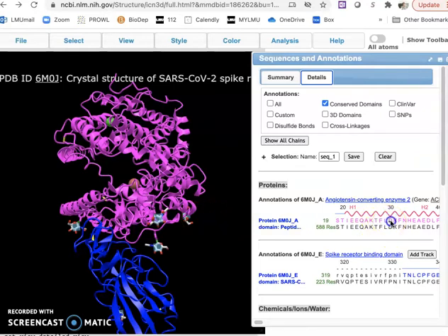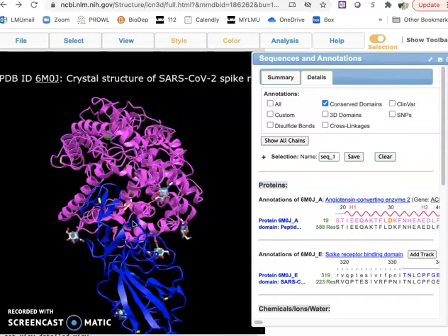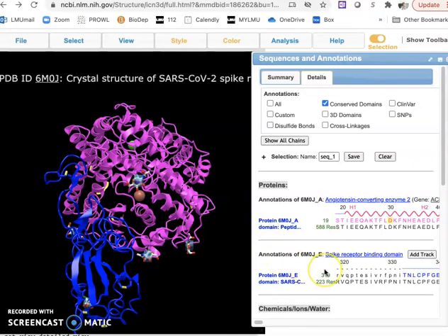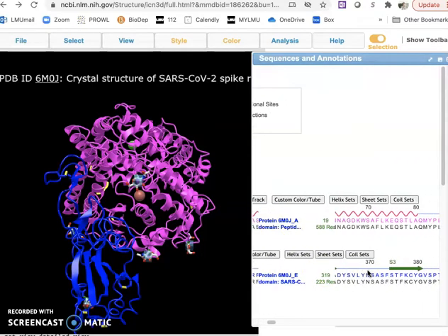One of them is D30 in the pink one. We will select D30, and you could see it's got highlighted here with yellow. And the second one we want to visualize is K417 on the spike.